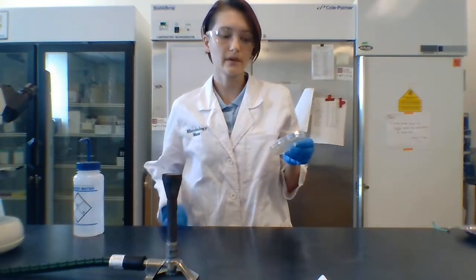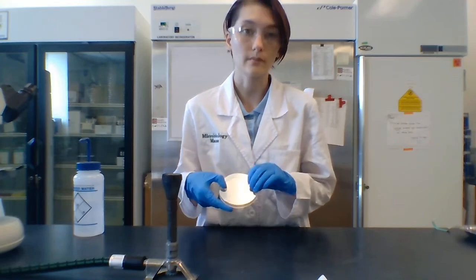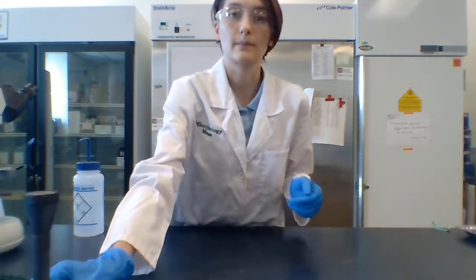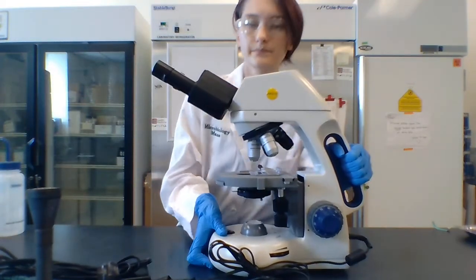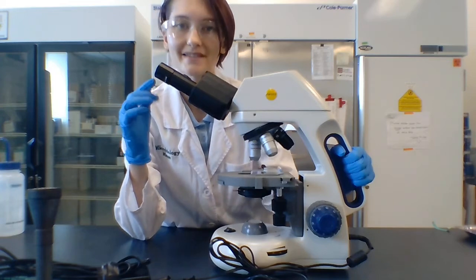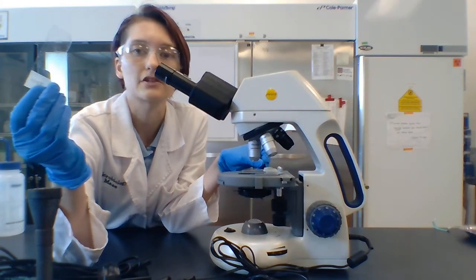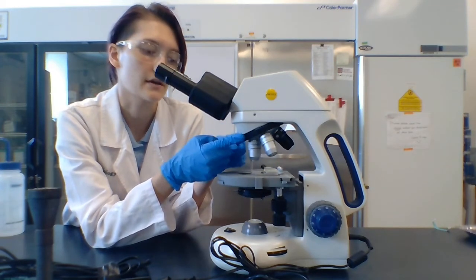So how do we examine these in a microscope? What we would do is we would pick up the germs and put them onto a microscope slide. That's a complicated process and it takes a really long time, so we're not going to do that. I'm just going to show you how you would use a microscope. So, if you've never seen a microscope before, this is what they look like. So there are ocular lenses, which are for your eyes. So that's where you would put your eyes. There's this stage, which is where we put the smear of our sample, which I mentioned, and there are objective lenses which magnify the sample.